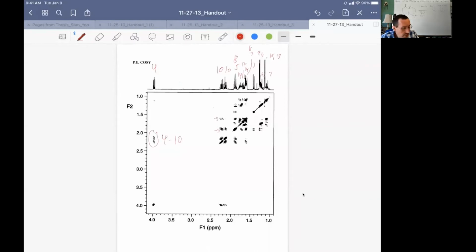They cross over here, but I'm not really sure because we've got stuff lumped together. So 8 and 5 are lumped together over here. So this is 10 with 8 or 5 or both. Over here, we've got 10 with 8 or 7, or both. So I really end up lost.